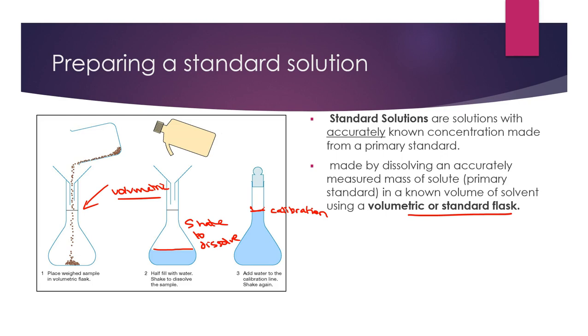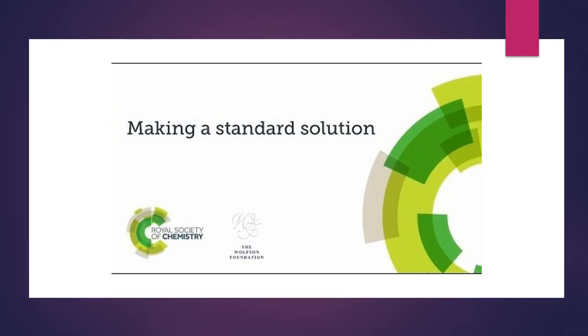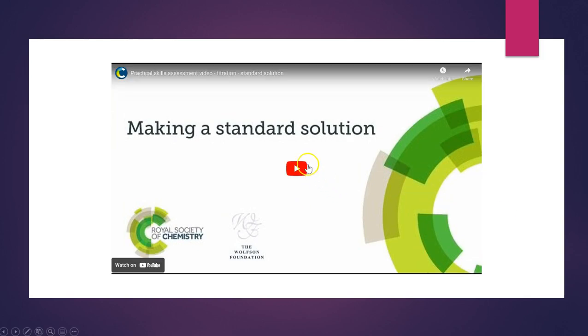In the next part of this video, it's actually going to play a setup of a standard solution done by the Royal Society of Chemistry. This will show you experimentally how this is conducted.